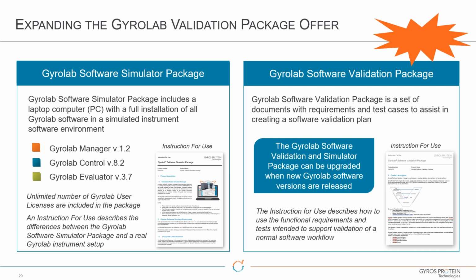Exactly. And I think sometimes this takes quite a long time. You know, we're talking 9 months. Yeah, I know. Probably the shortest time I've seen a CSV done is around 3 months. But it can take 4 to 6 months, and it's a laborious process to get all the test scripts written, and then your testing, and then also the review of the data by quality assurance, etc. So it is a long process.